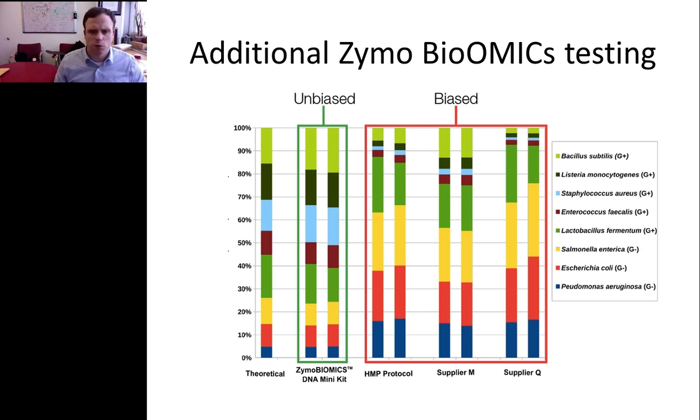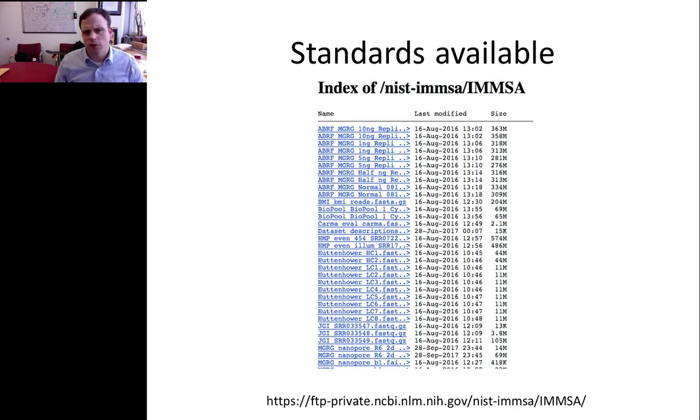As I mentioned before, all these data that we put out there from the paper from Alexa McIntyre, who's a grad student in the lab, are publicly available. They're there for people to use for their own testing of algorithms or methods, and really built because I wish they had existed when I started working a lot in metagenomics. It's the first beginning step to have some of these standards out there.